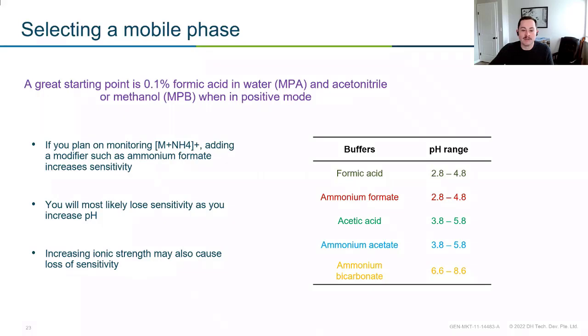And you're going to want to make sure that you're doing this regularly, right? These things are volatile. So as we let them sit, our mobile phase essentially gets, we call it old, but we're just losing our modifiers or buffers. So if you notice, for example, the sensitivity of certain ions decreasing over time, and you look up on your LC stack and you see that you've been using the same mobile phase for a month now, it's probably a good time to make a new batch.